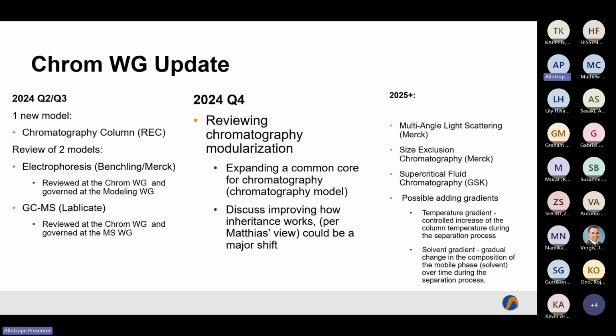He's the one that manages and runs that, and he's been giving his input for the chromatography column model to basically record that information so that you can have that in an ASM form and be able to do your comparisons of your columns to go, yeah, okay, we need to switch out, let's use that one. So we're trying to bring that construct into the Allotrope fold.